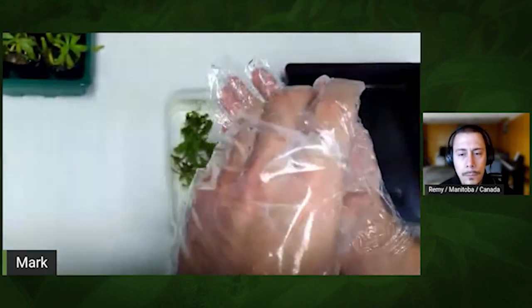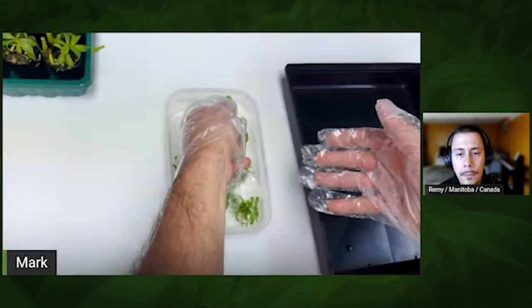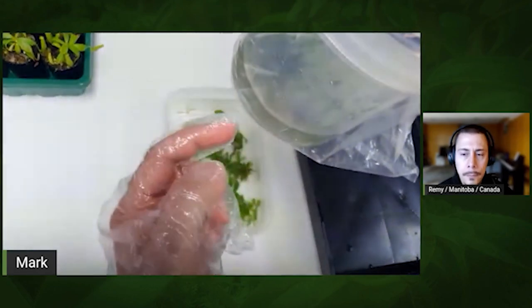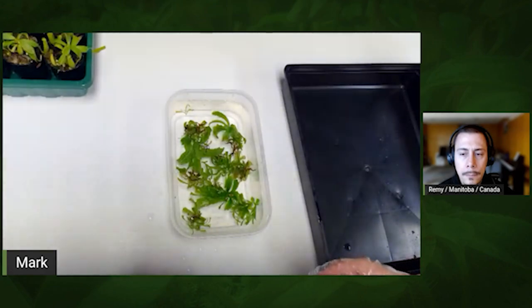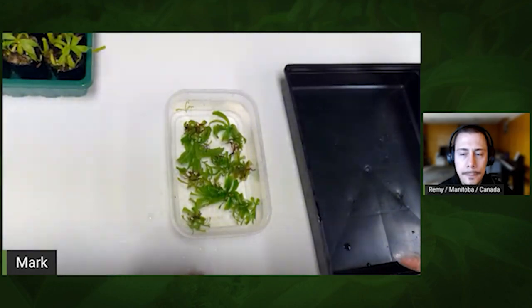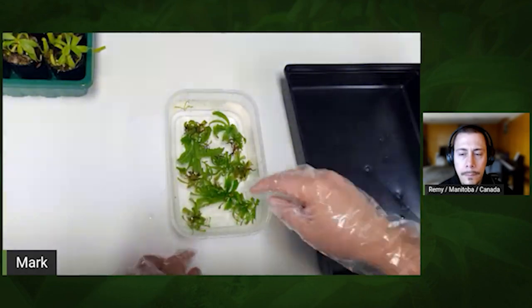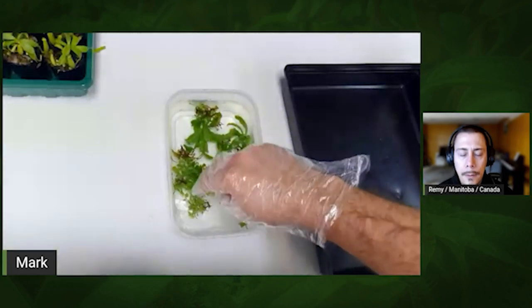It really depends on the labs and how good they are. The substrate inside the flask has all the nutrients the plants need — sugars, whatever nutrients. If they add too many nutrients, the plants will feel lazy. The plants will think, 'I have everything I need,' and won't grow roots. Good labs add certain amounts to help plants grow in the flask while also provoking root development — not adding so many nutrients past a certain stage.